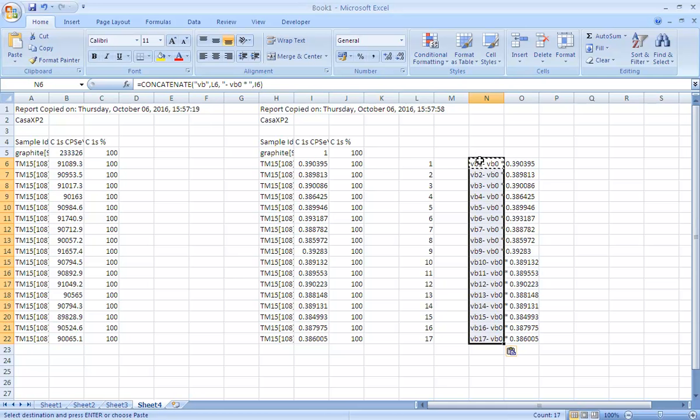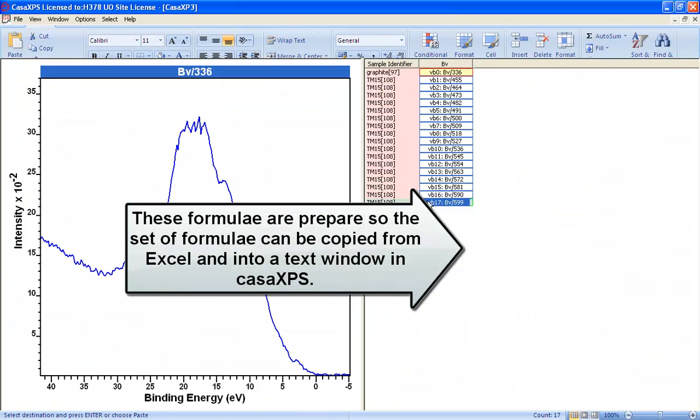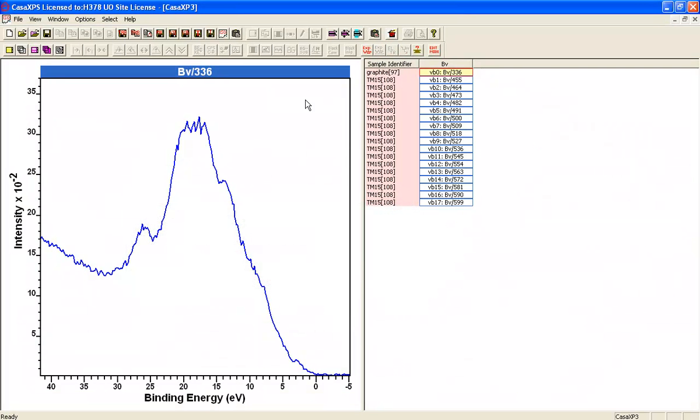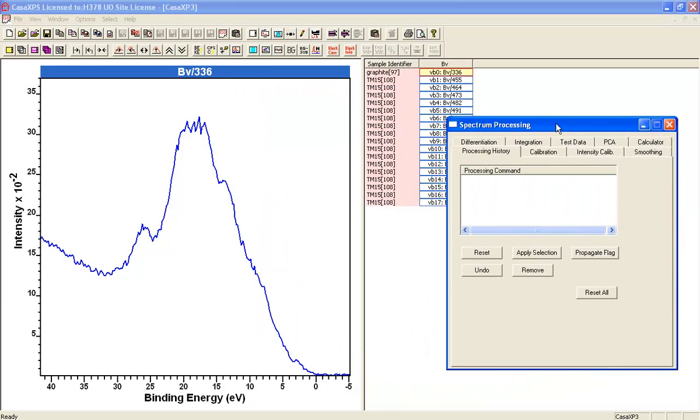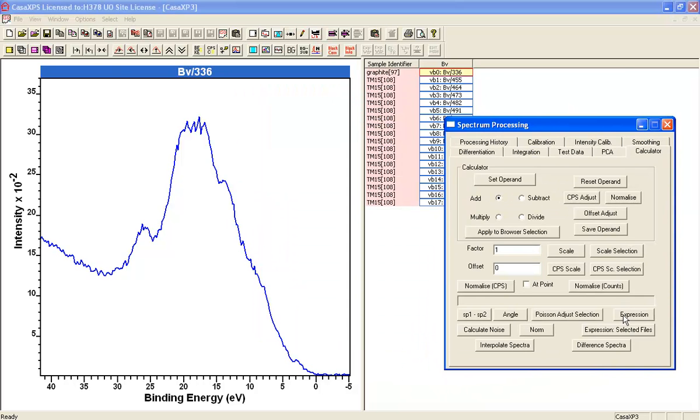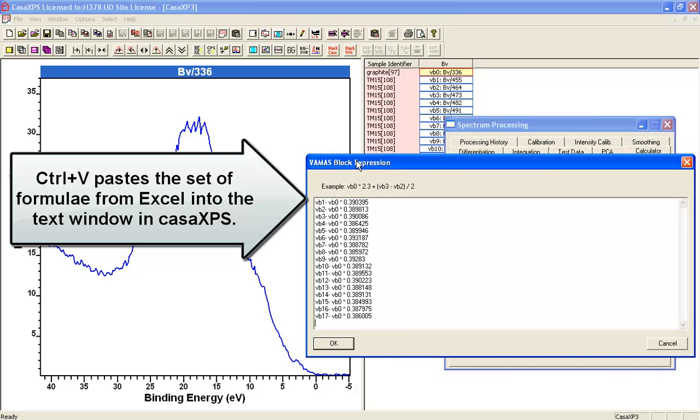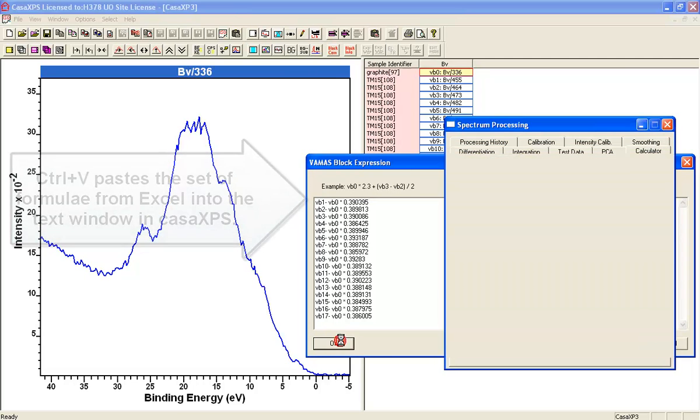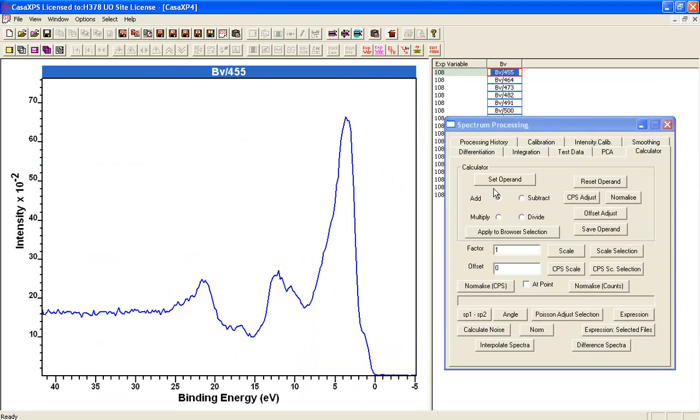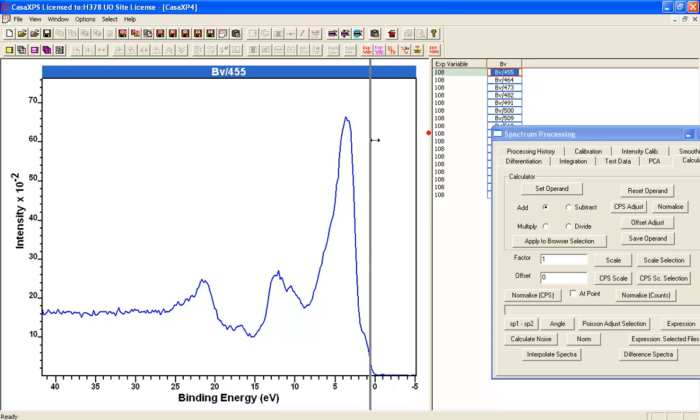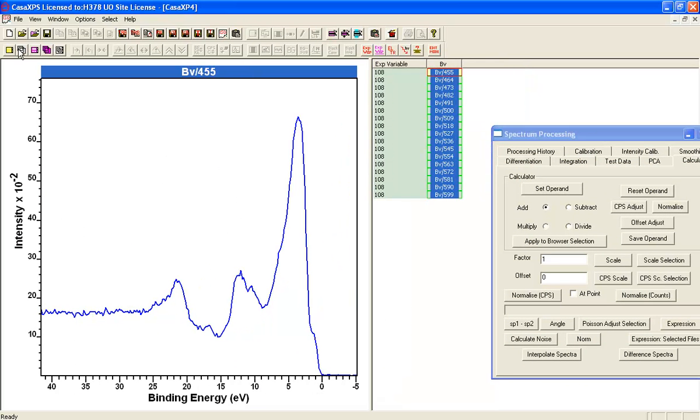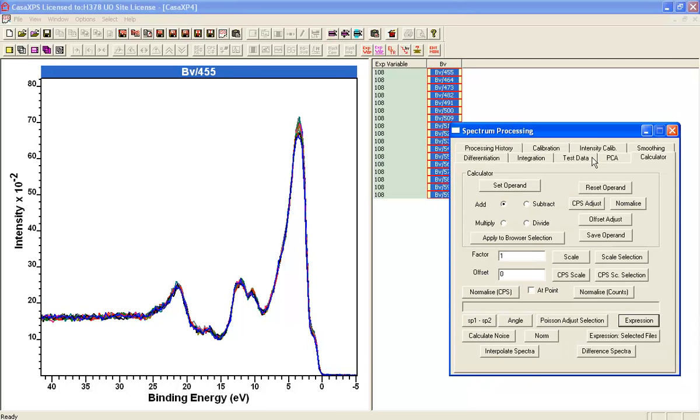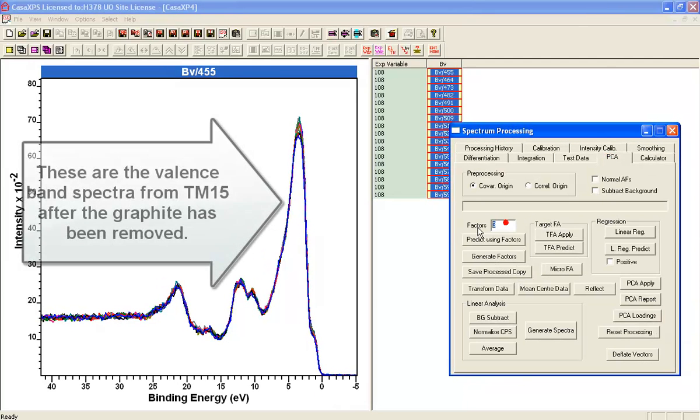If we copy this formula all the way down this list, we've now got a set of formulae that we can now copy and paste into the spectrum processing option on the calculator property page as expressions. This means we can enter these expressions and then calculate from this file a set of valence band spectra that have been modified to remove a proportion of graphite. Now you can see that we've got all of these that are nicely organized without the graphite.